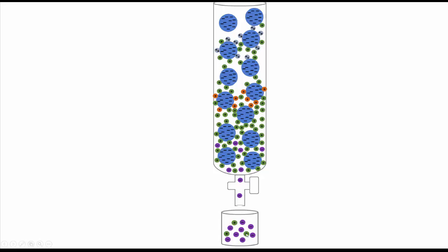There might be some sodium particles as well from our resin, but as we know, sodium is very soluble in water, so they will be easy to remove from these negative particles when we want to get just the negative particles. As we can see as well, those double positive ions haven't traveled very far, and the single positive have moved a little bit.